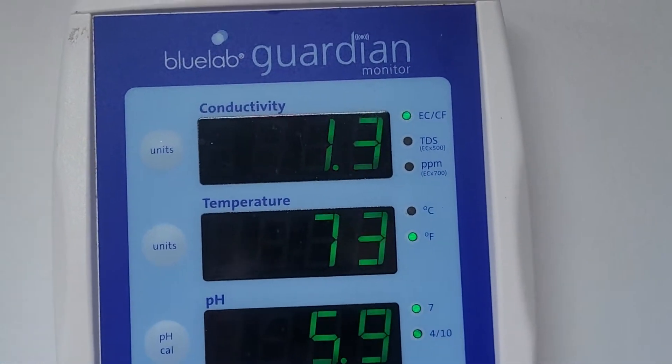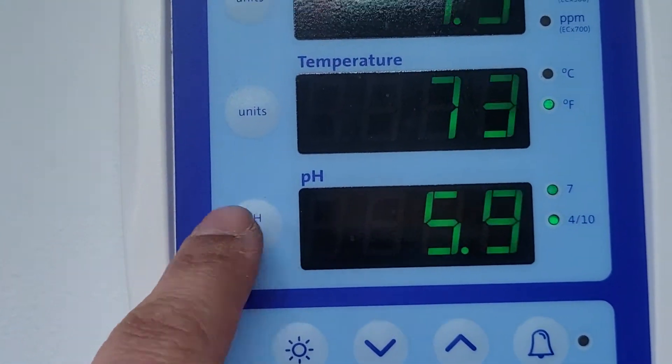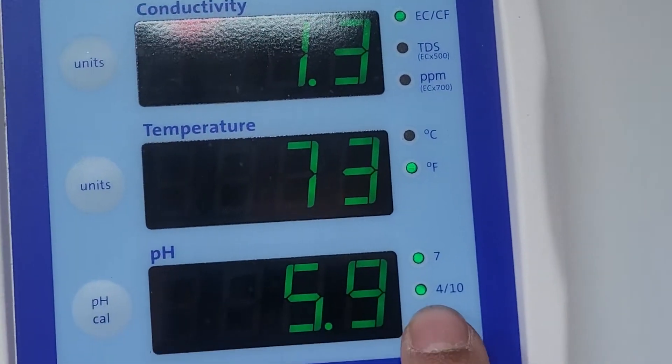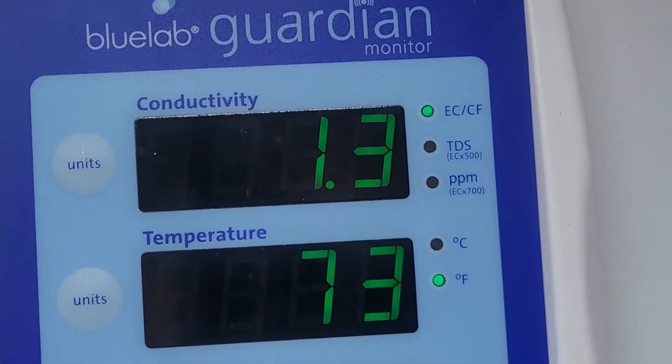This here's another nice one — badass for reservoirs and stuff like that. To calibrate it, you just hold this little button, just like calibration on the pen meter. It's going to come up with the 4, and then the next time it's going to be the 7. Easy peasy.